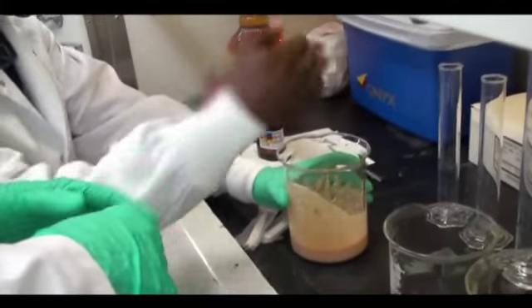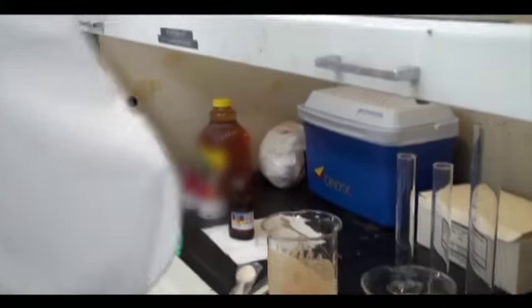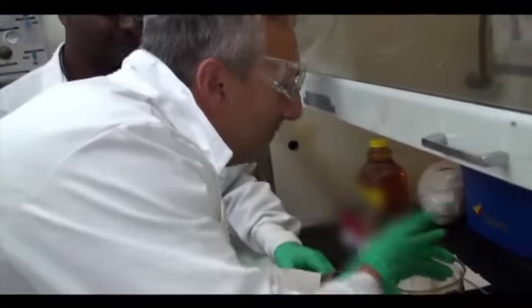You don't want to put your nose directly over this, so you're gonna hold one hand, and then you're gonna just take your hand over and wave it and bring the smell to you. A Ziploc is more pro. You need the zip. Do you want me to leave it there, though? Yes. This is like those guys with the wine. You see those guys with the wine? They tell you to smell it and everything. Am I holding up the process here? No, you guys are good. We gotta know what's right.